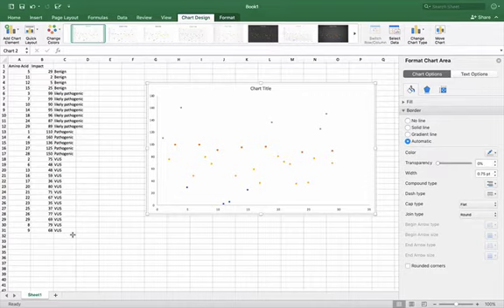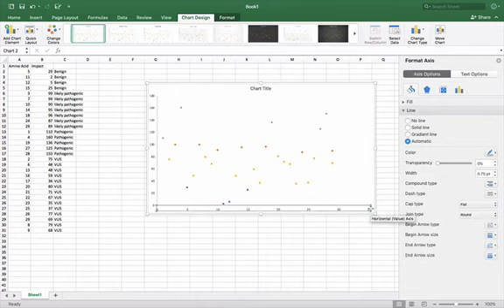Then you can make that individual dot stand for your variant, and we can identify it within the spreadsheet, the scatter plot that we have here. So now I've got that turned off. So the amino acids, we have actually 30 amino acids. So I want to adjust this so that there's not all this blank space on the end of the category.